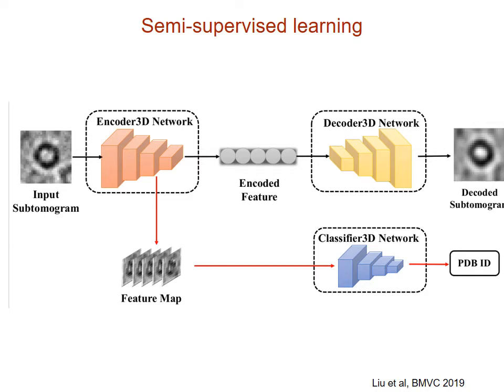We have developed a semi-supervised learning method that makes use of the autoencoder to include a certain amount of self-supervision to help improve the classification accuracy and at the same time significantly reduce the amount of subtomogram annotation work.